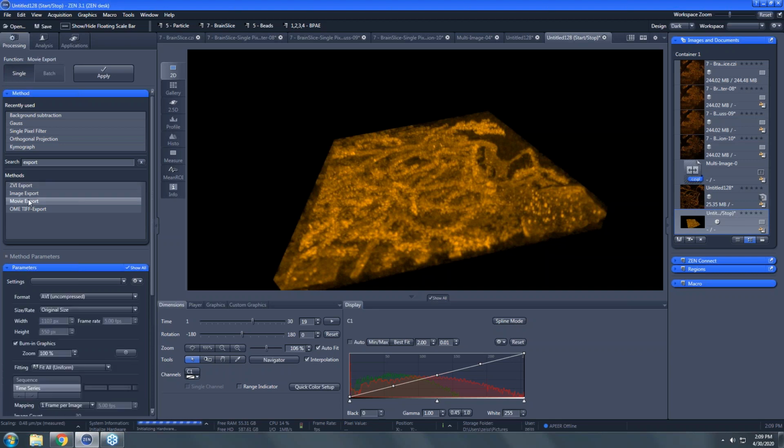And I would suggest using the defaults there, with the exception of going to, I think the default is MPEG compression or MJPEG compression. I would always use the uncompressed version so that we don't introduce any artifacts. Doesn't make sense to get this beautiful image and then have some compression artifacts when you do the render.